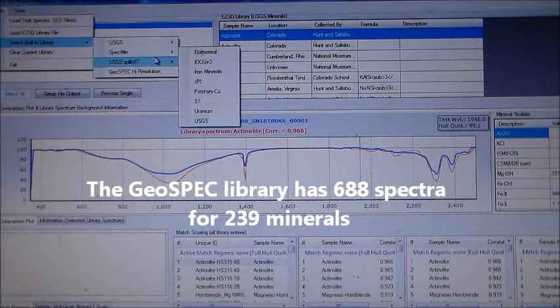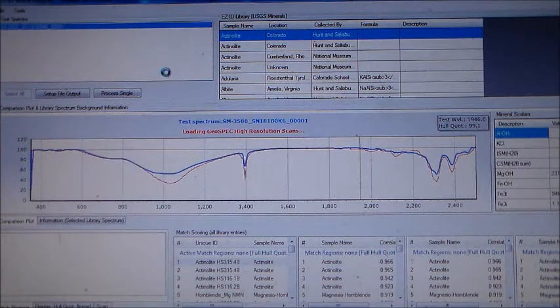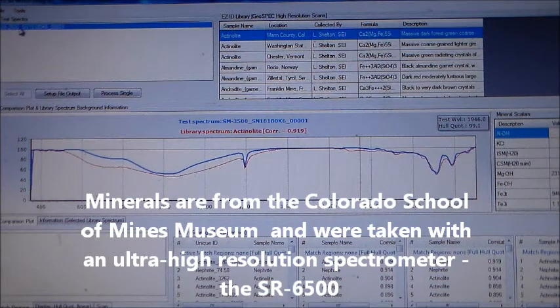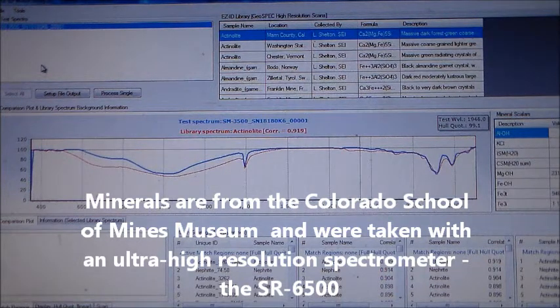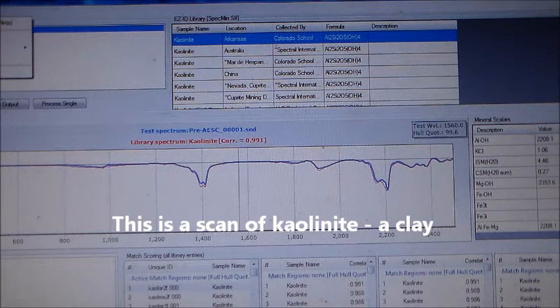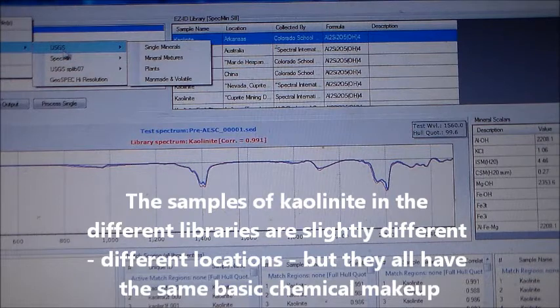The minerals were from the Colorado School of Mines Museum collection and scans were taken with the ultra-high resolution SR6500 spectroradiometer. This is a scan of kaolinite, a clay. The samples of kaolinite from the different libraries are slightly different locations, but all have the same basic chemical composition.